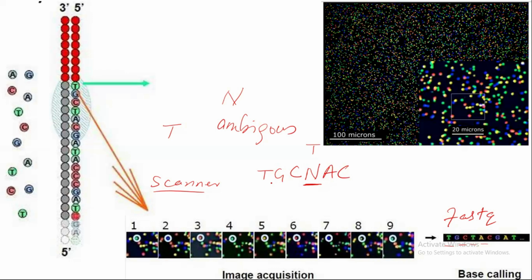Each and every base has a quality. I have discussed this quality in the previous video, so just link that video with this tutorial. First watch that video, then you can easily understand this.